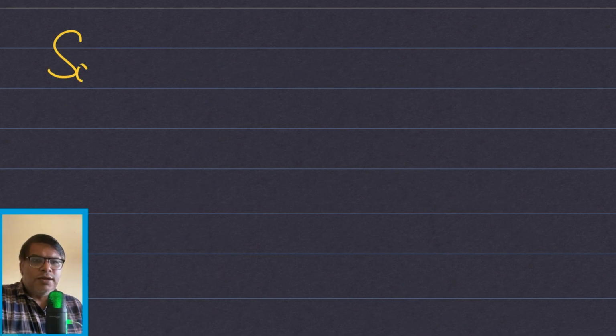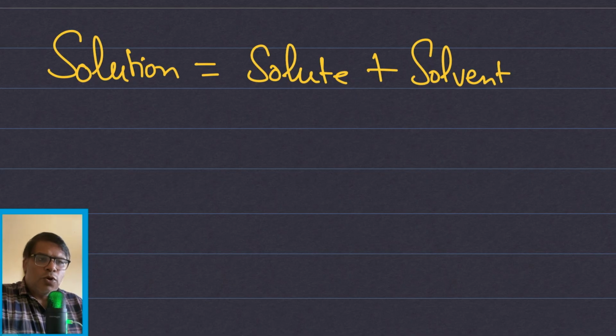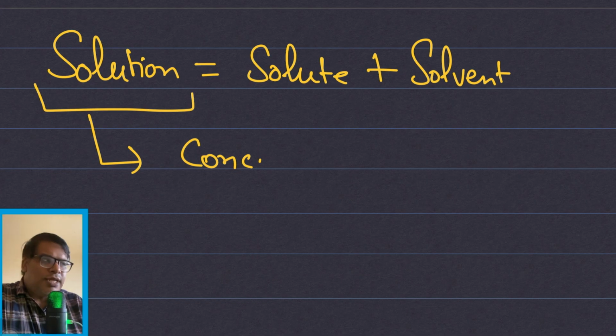Now hopefully you must know what a solution is. It is a mixture of solute plus solvent. In any laboratory, whenever we work with a solution, we work with some desired concentration, most of the time expressed as molar concentration or percent concentration. So what is concentration?